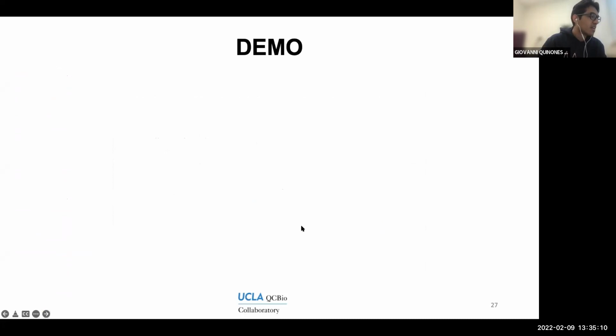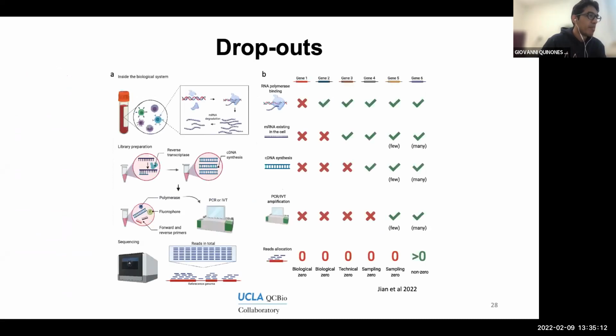Like I just showed you, the feature count matrix that we're going to work with is a matrix that is mostly empty, that has a lot of zeros, or the proper term, proper in the way that this is the name people use in the field, but at the same time not so proper because the name is a little misleading.